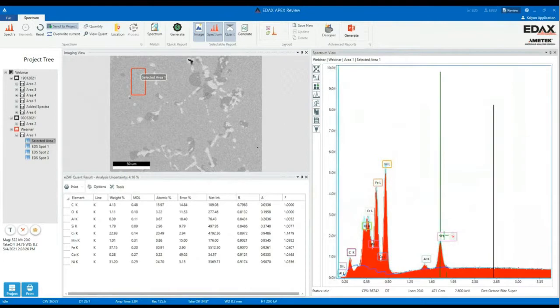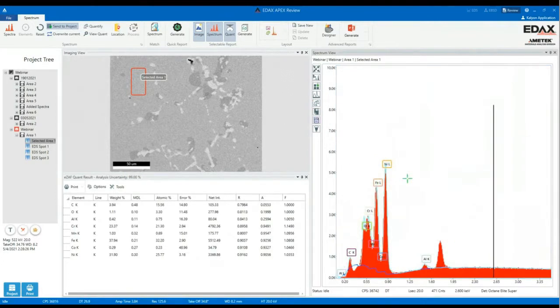By making changes on the spectrum, for example, by getting rid of silicon, this box will turn purple. And by clicking on this box, you will save the changes on your spectra. So by reopening the spectra in 2 days or so, the change will be there, meaning the silicon will not be in your spectrum. But if you do not save the changes, your silicon will be in your spectrum. In this case, silicon is inside, so I will edit, save.